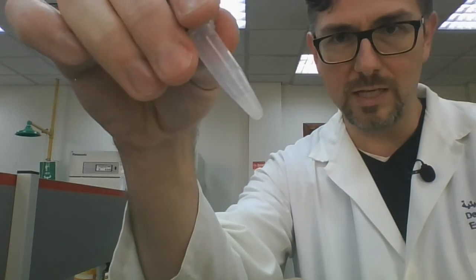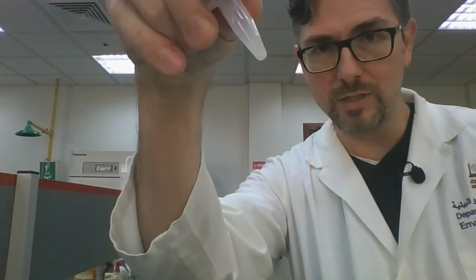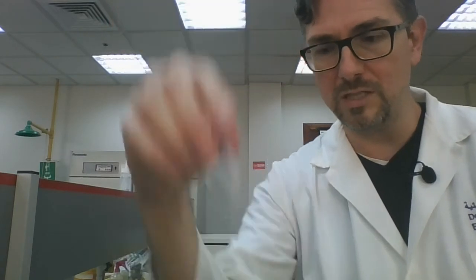And so what we have right now is a solution that is mostly resuspended. I still see a little bit of a pellet, so I will continue working with this one, and then I will resuspend the second one. So this one's done. Again, this shouldn't take a long time, as long as you are holding the tube at about a 45 degree angle inside the vortex, you get a nice cloudy solution pretty quickly, so you get a resuspended pellet very fast.